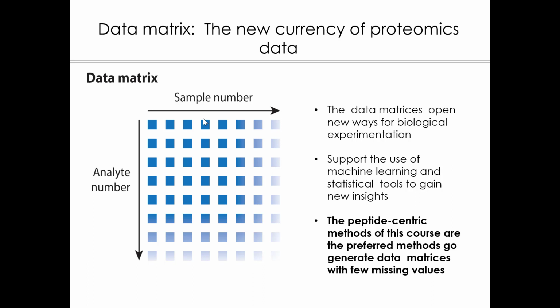data-driven analysis. So the picture I think you might carry forward in this capstone module is that of a data matrix, and you should ask now how we build such data matrices and how do we then use them to learn something biologically important. It turns out that the only methods in proteomics that can deliver such matrices, which are quantitatively accurate, have few missing values, and are generally reproducible, are the techniques we talk about here.